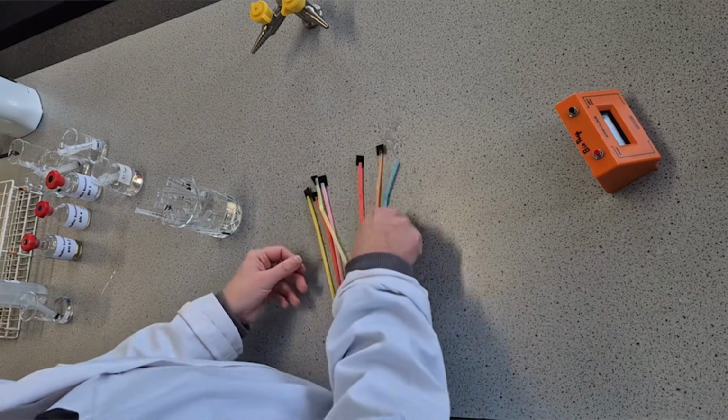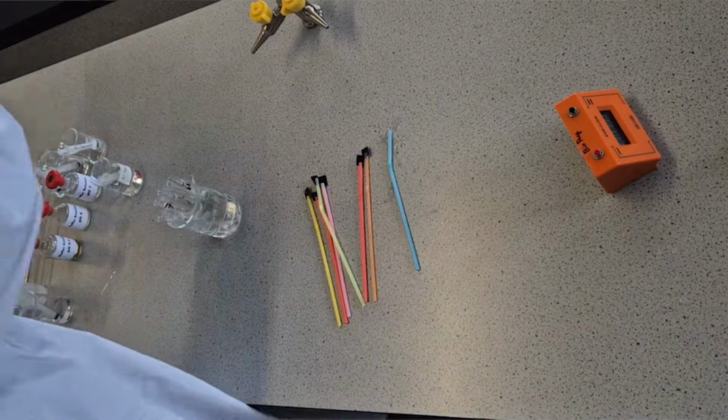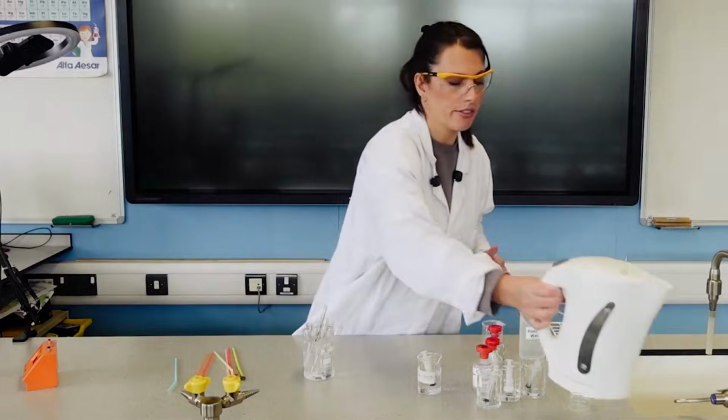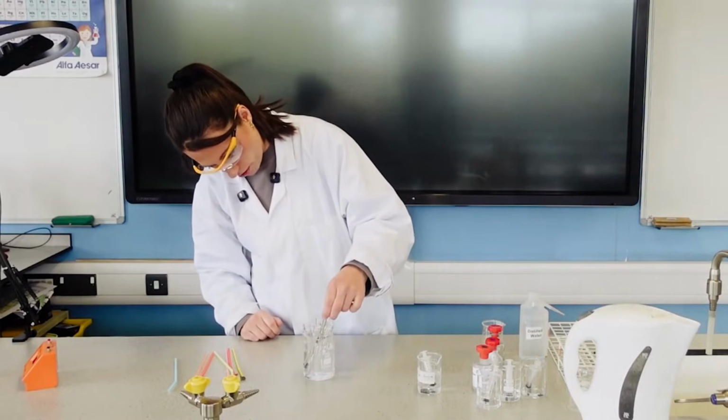Let's just check first of all that it is at 40 degrees. So my water bath has actually dropped in temperature down to 28. So let's add some hot. Another reason why I say only half fill it, because you're going to need to top up with hot water throughout.